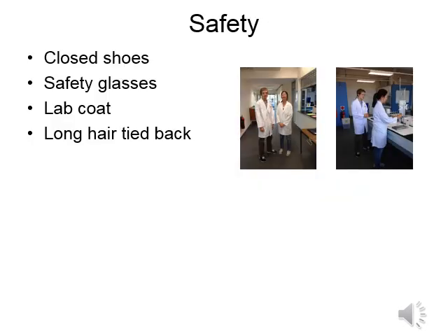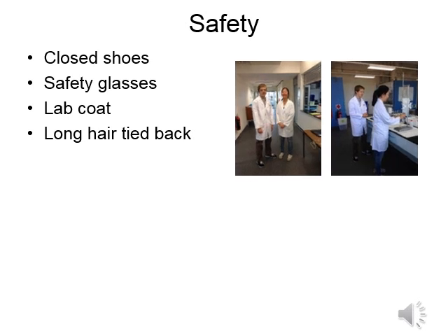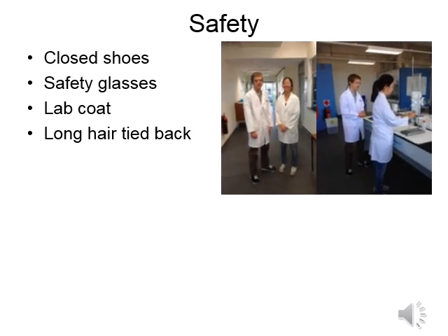It is essential that you think about safety and work safely whenever you are in the lab. You must be wearing closed shoes, safety glasses, a lab coat, and have long hair tied back at all times. Whenever you step out of the lab, even if it's just to go to the toilet, you must take off your lab coat. You are not allowed to wear a lab coat anywhere in the common areas of the building.